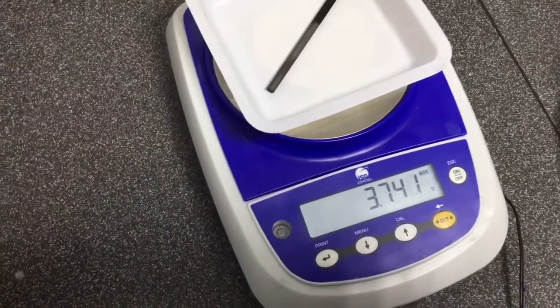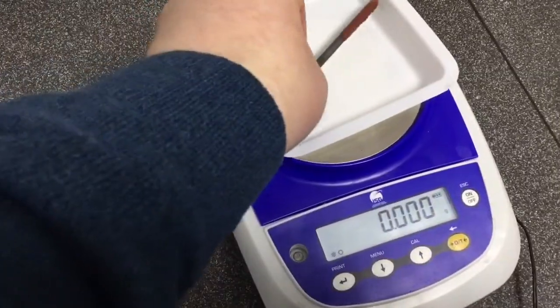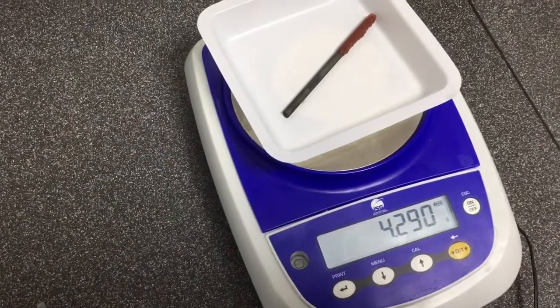When the electrodes are re-weighed, you can see that the anode has roughly the same mass, whilst the cathode has gained considerable mass due to the addition of copper.